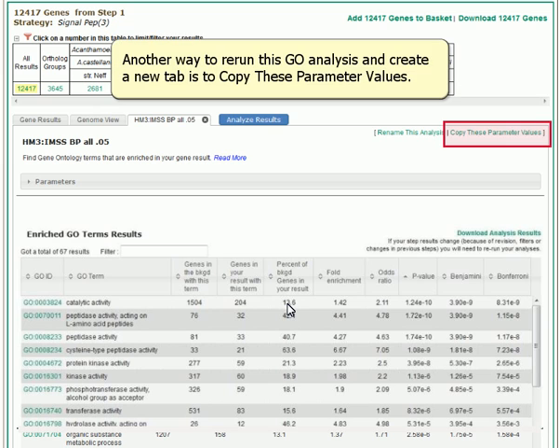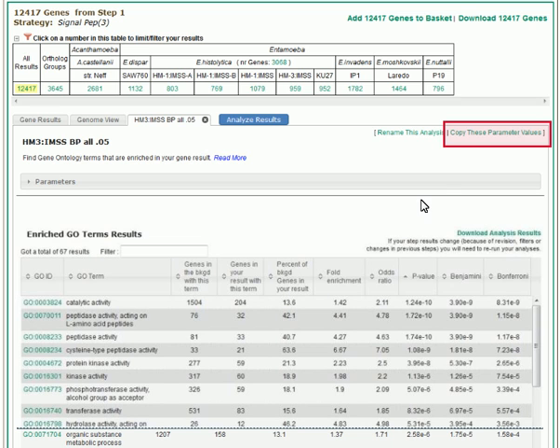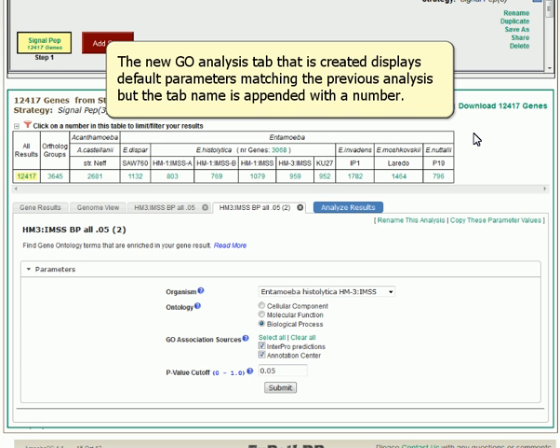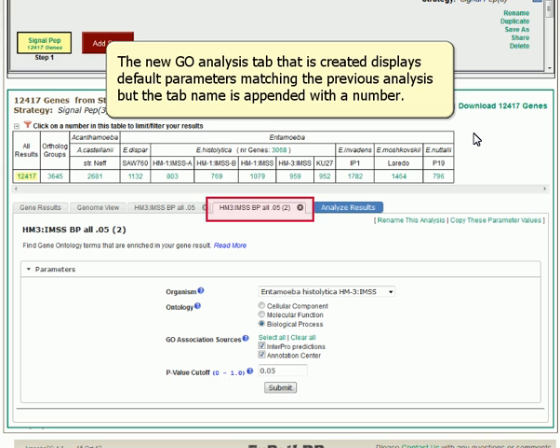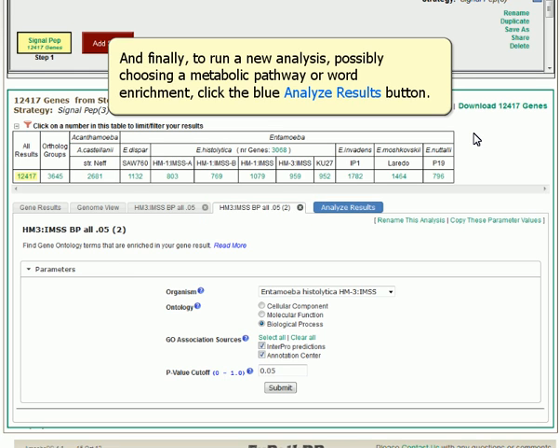Another way to re-run this GO analysis and create a new tab is to copy these parameter values. The new GO analysis tab that is created displays default parameters matching the previous analysis, but the tab name is appended with a number. And finally, to run a new analysis, possibly choosing a metabolic pathway or word enrichment, click the blue Analyze Results button.